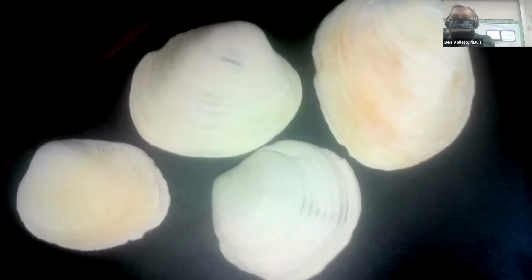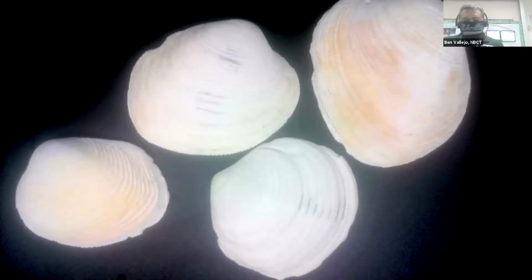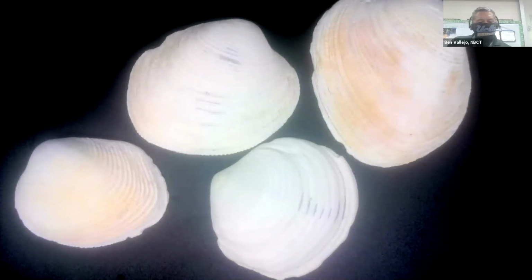We need to be able to see those bands, because what it is, you guys, is it's like the rings on a tree, right? So what we're going to do is count those, and then we're going to figure out the average bandwidth, the number of bands, and then the age of the shell. Okay, so let me get rid of these for a second, and we'll set up a data table and record our information.